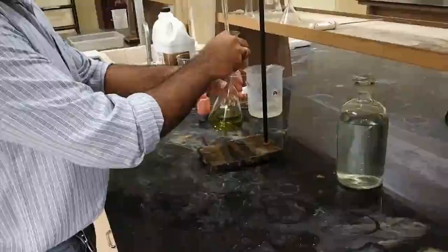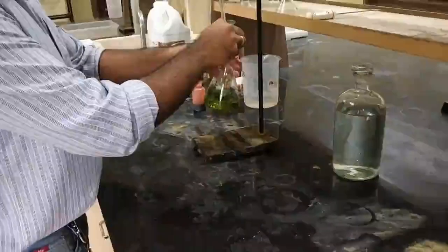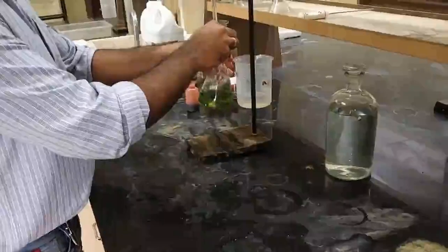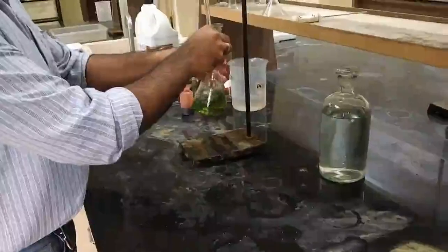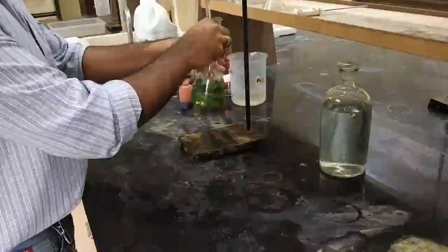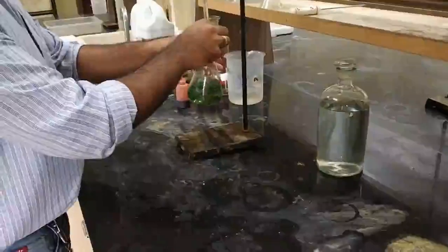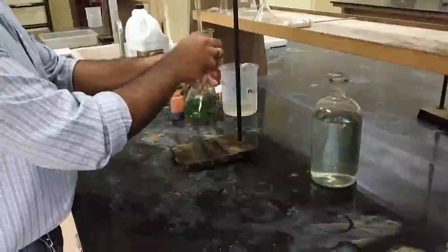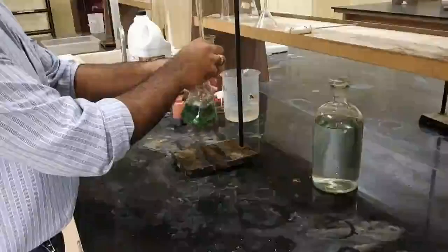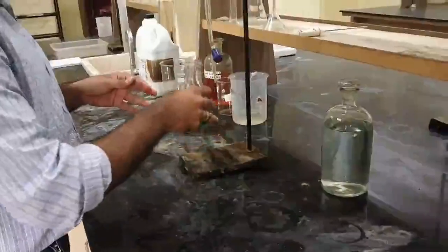Again a different color. A different color. Now this color will disappear and the red color will start to appear. Right? So this is not a final color that we have obtained.